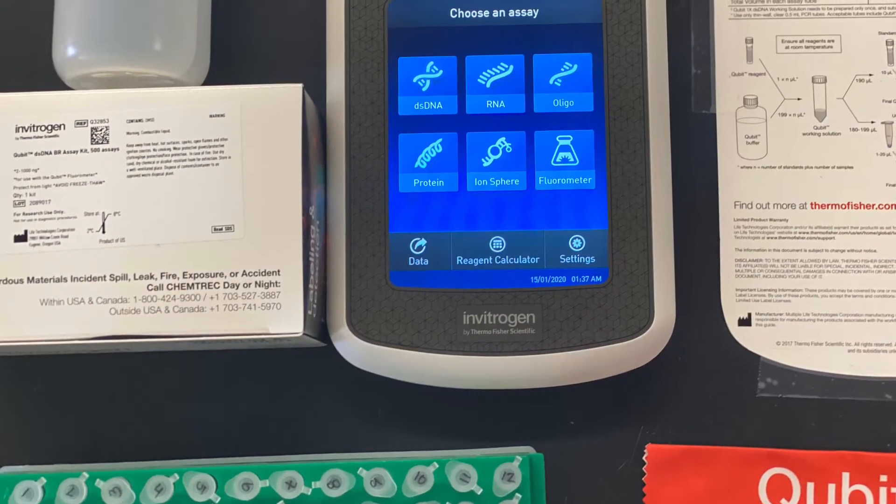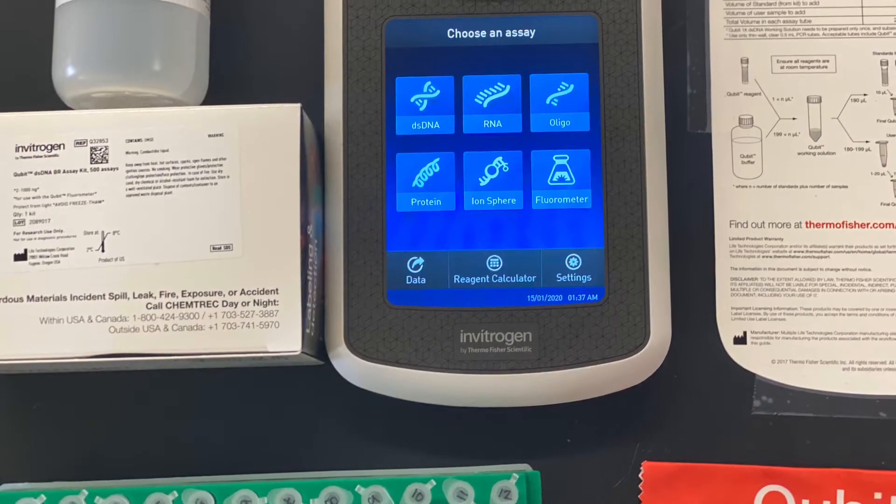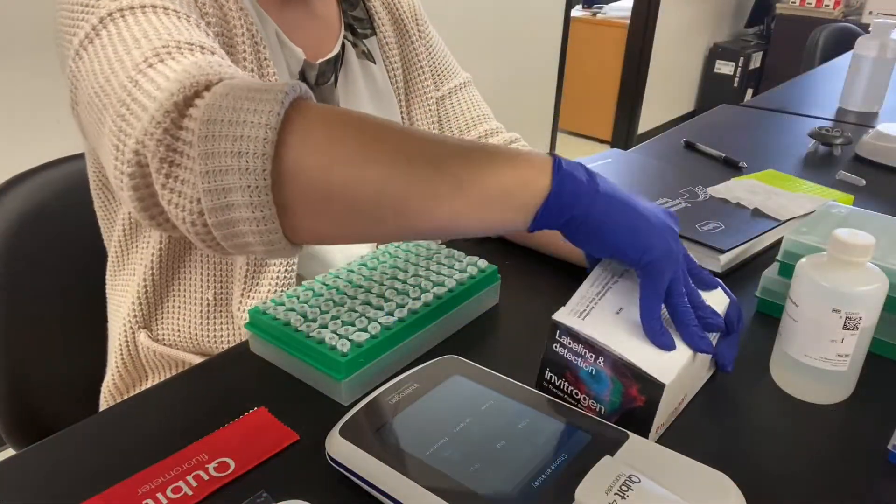For this video I'm using the broad range double-stranded DNA kit, but we do offer services for quantifying double- or single-stranded DNA as well as RNA through high sensitivity and broad range kits.